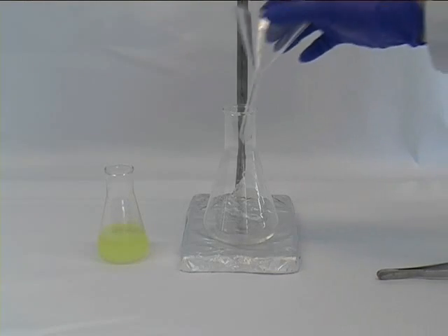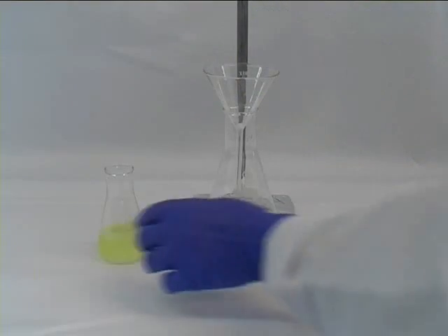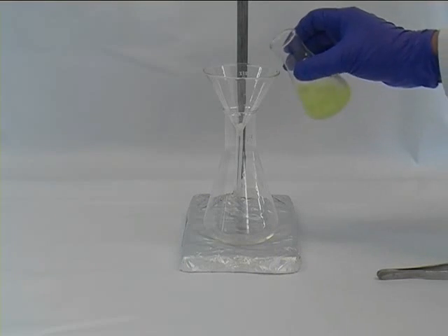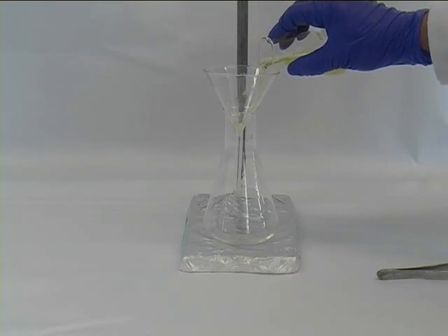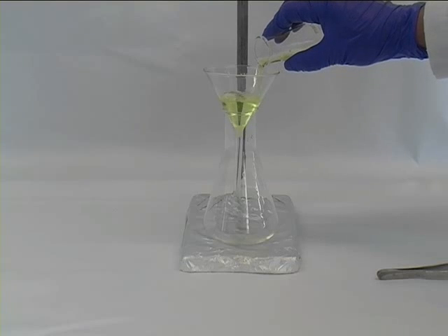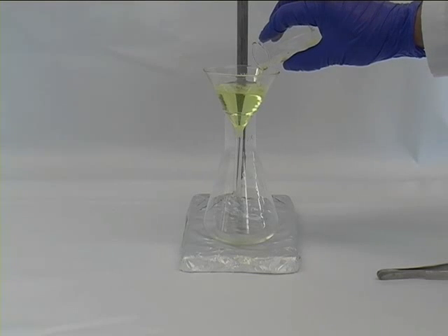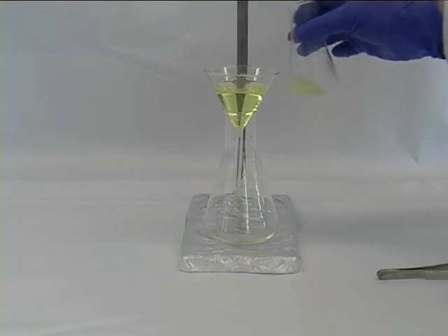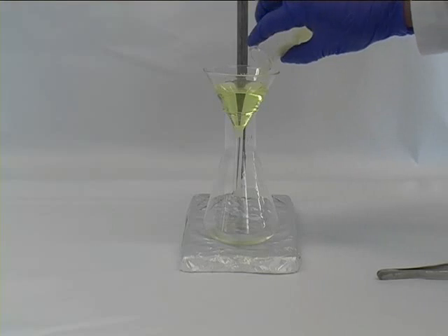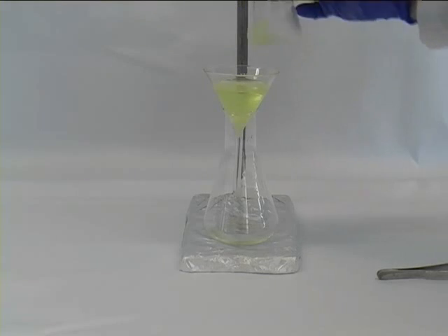Also you can plug the outlet of a standard funnel with some cotton wool and use that to filter your solution into a standard conical flask. This whole process affords also a yellow solution, however the whole process is much slower and it is sped up in this video.